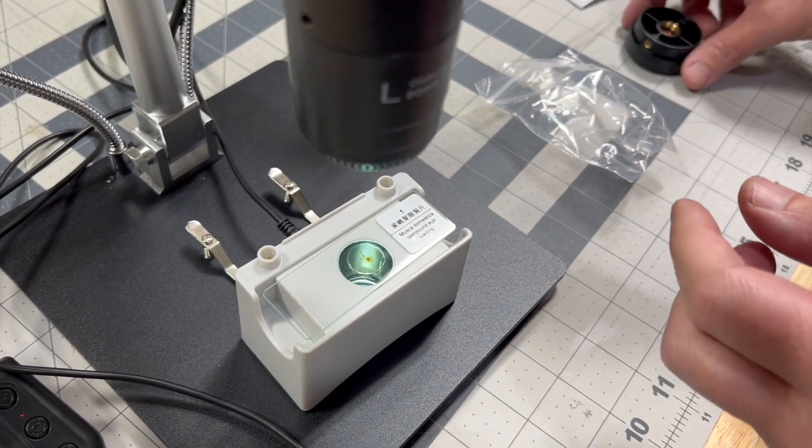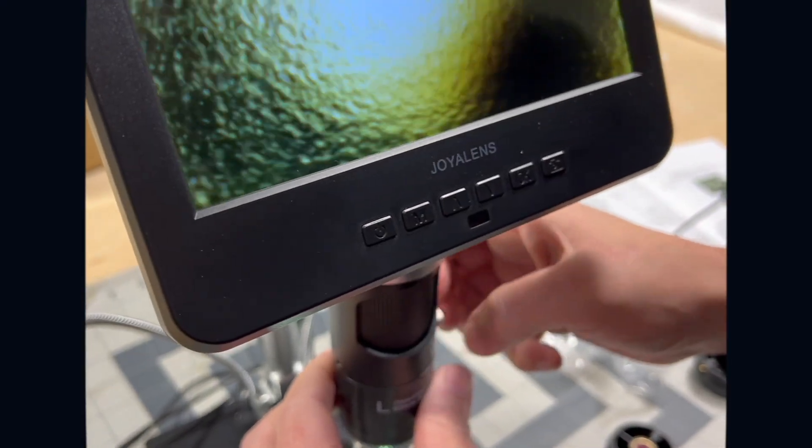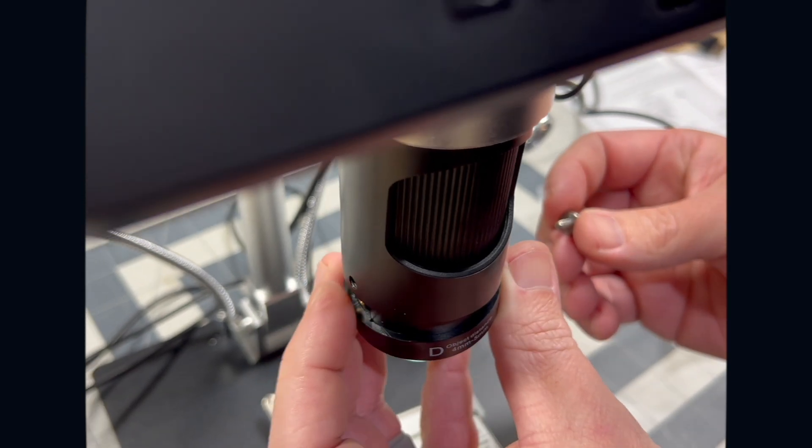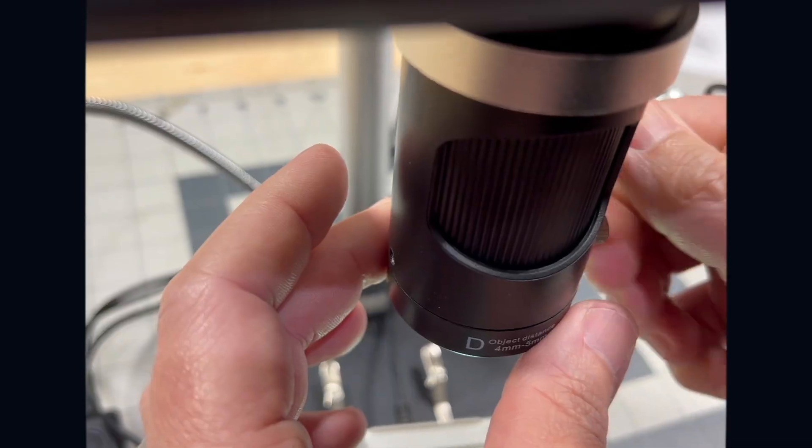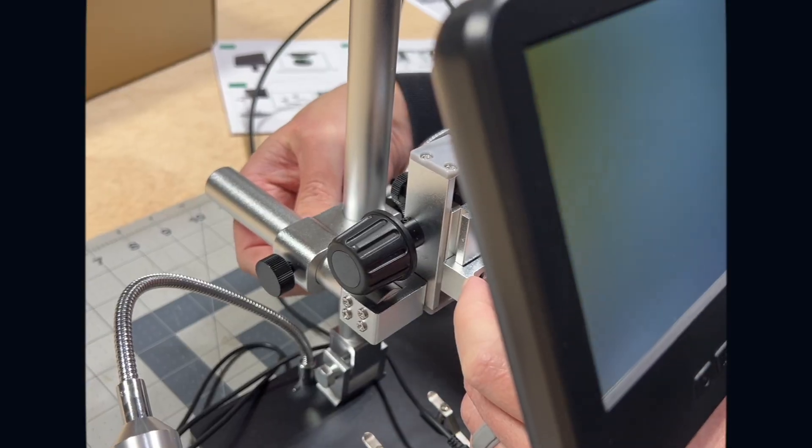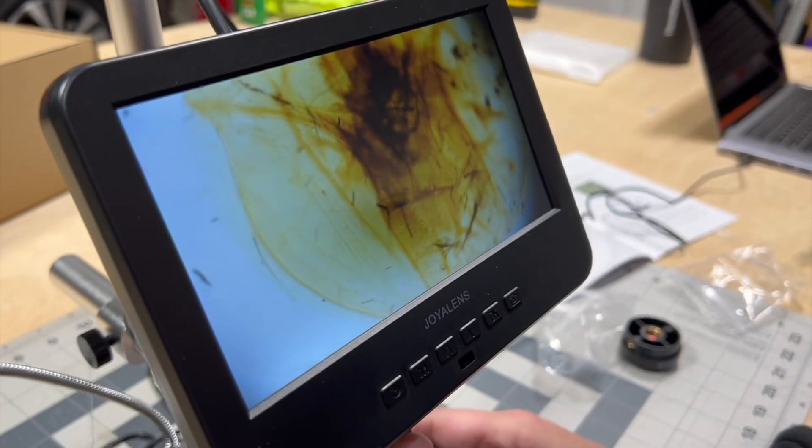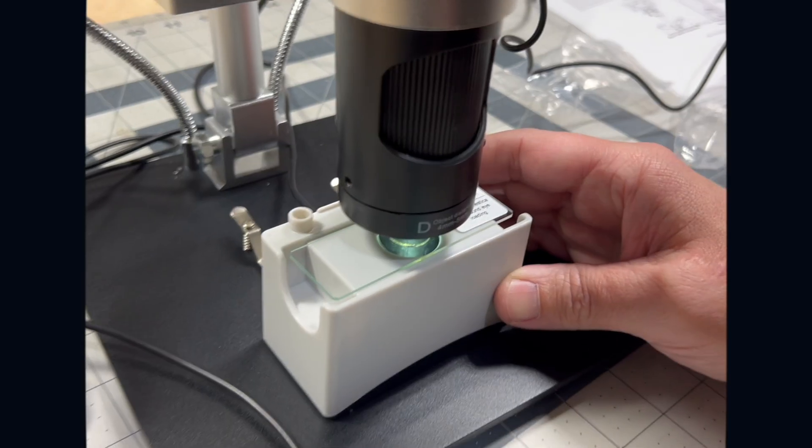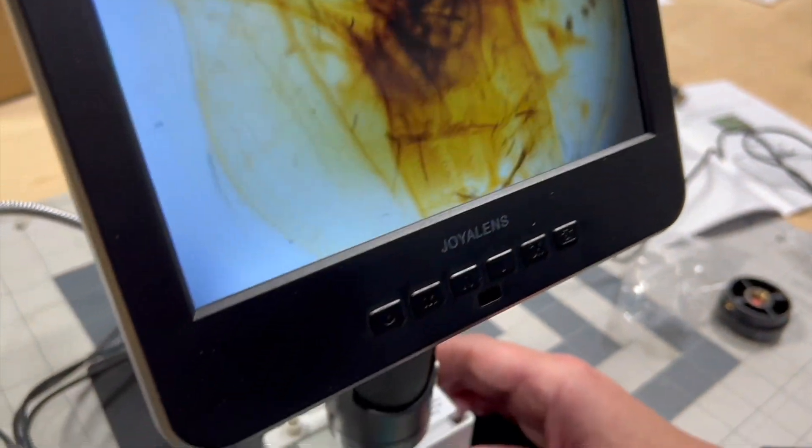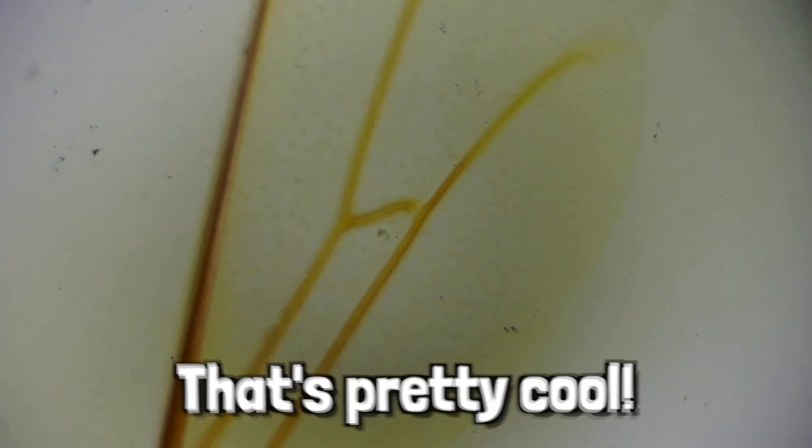And we need to change to our even closer up lens, our D lens. Oh wow, that is really in there. That certainly is magnified. I don't know what that is but here's a honey bee wing. That's pretty cool.